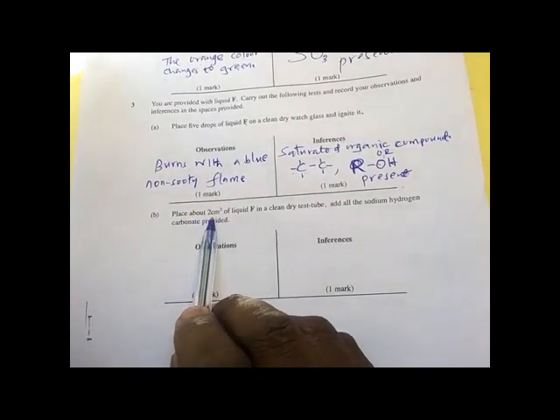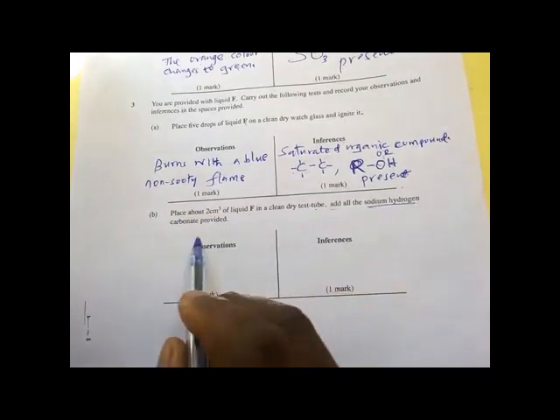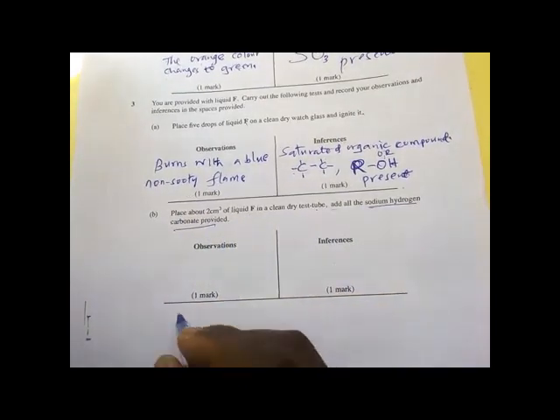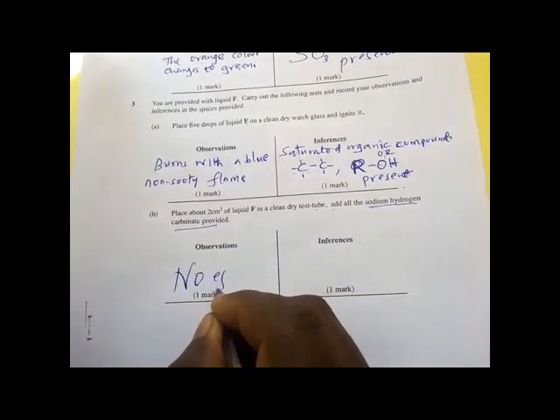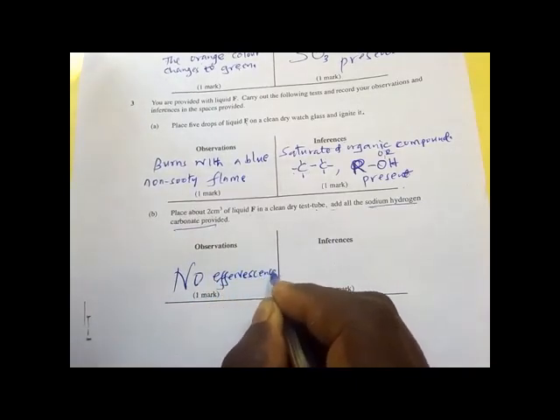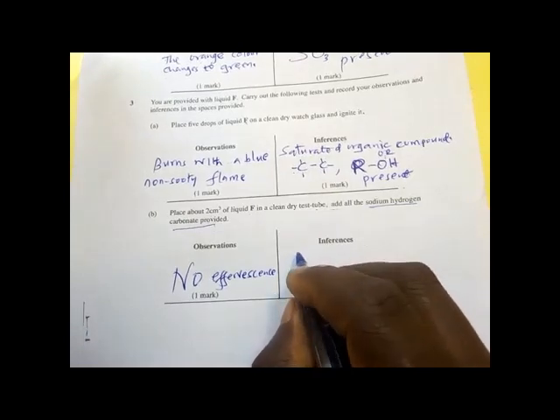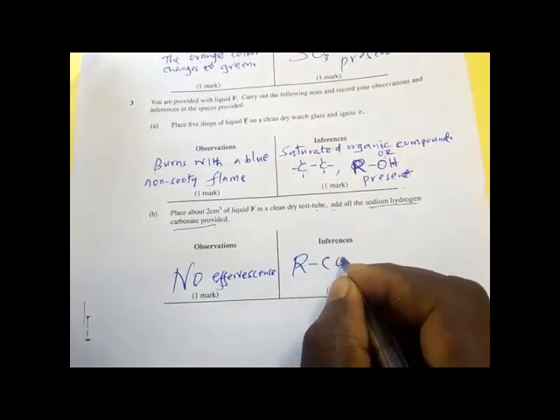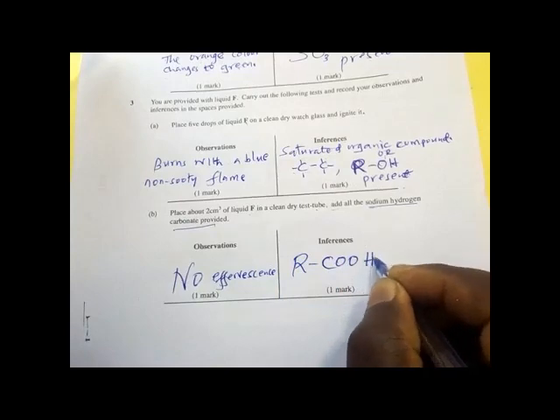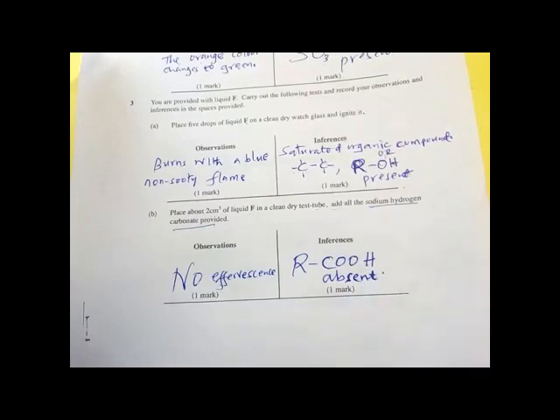Place about 2 cm³ scoop of F in a clean test tube, and then add sodium hydrogen carbonate. There is no effervescence, because that's what we expect. There is no effervescence. Then it means the alkanoic acids are not there, are absent.